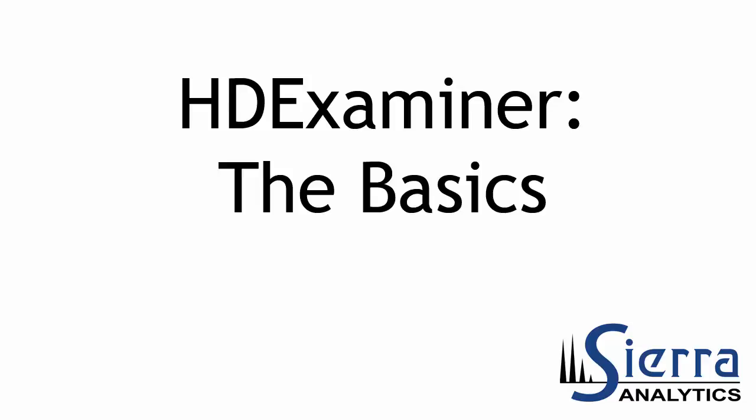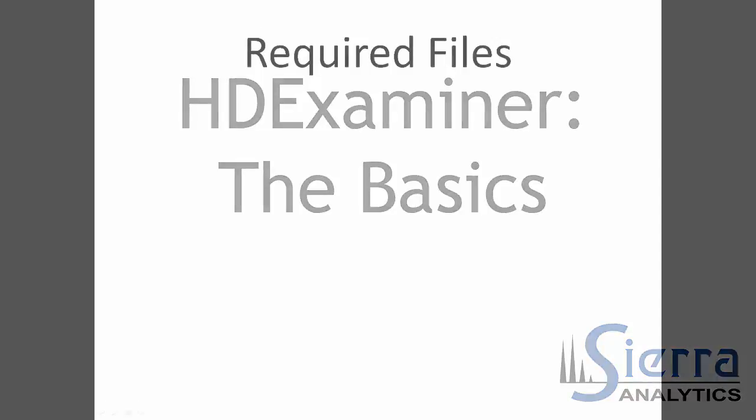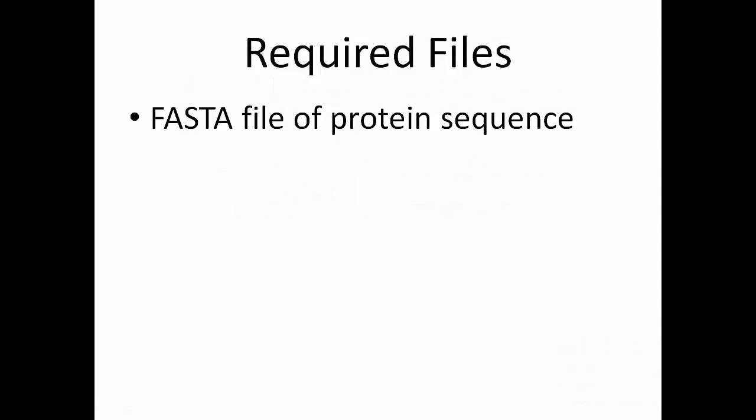Hi, I'm Jeff Morrow from Sierra Analytics, and I'm here to teach you the basics of HDExaminer. HDExaminer is a comprehensive software package for doing HDExchange mass spectrometry data analysis. Using HDExaminer, you can turn your HDXMS data into a clear picture of the overall deuteration behavior of your protein.